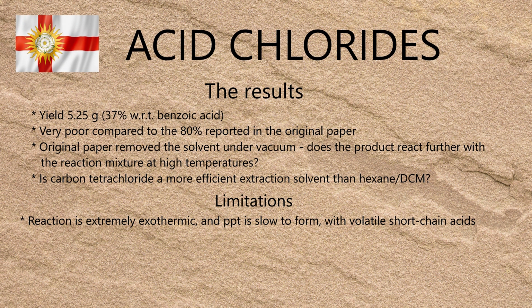When I tried the reaction on this scale with acetic acid, an ice bath was needed during the triethylamine addition to keep the temperature under control, and an awful lot of smoke was formed in the headspace of the flask, likely the salt of the acid and triethylamine. It also took several hours for any precipitate to form, meaning the reaction mixture needed to stand overnight, and it was just a general pain in the arse all round.